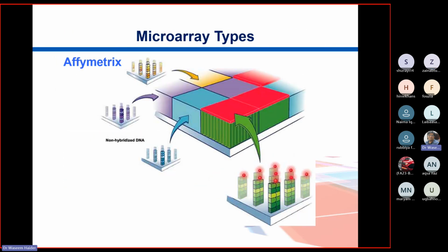What problems were happening in this microarray was that you are doing it on glass slides, and sometimes there is dust on the slide, or sometimes cross hybridization is also possible, and sometimes you get some noisy regions, and then obviously you are restricted to get only the genes which are highly expressed or which are significantly expressed.